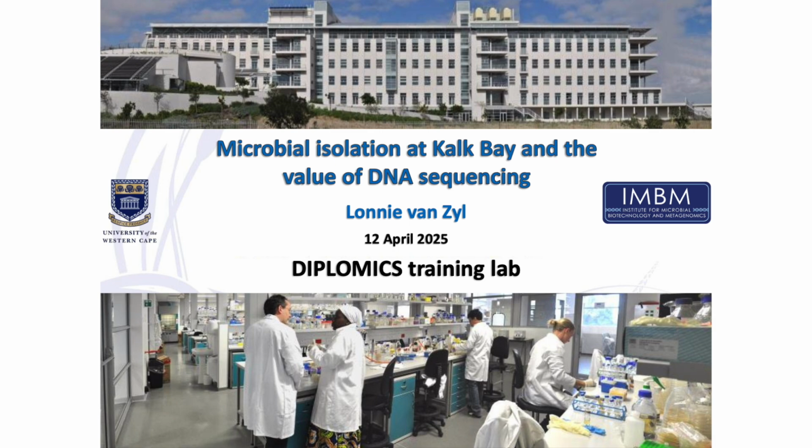But of course, today really is just about introducing you to the technology, getting your hands on, and the latter part of this, which is the data analysis, we're not even going to do today. But I'll tell you a little bit about that after we finish setting up the sequence runs. All right, so let's get into it.